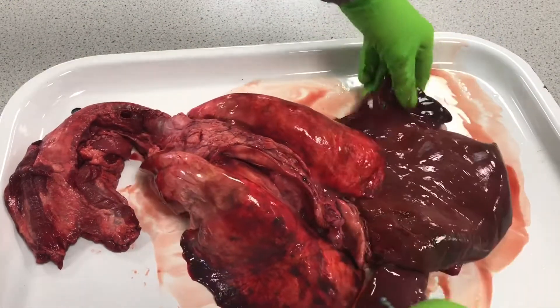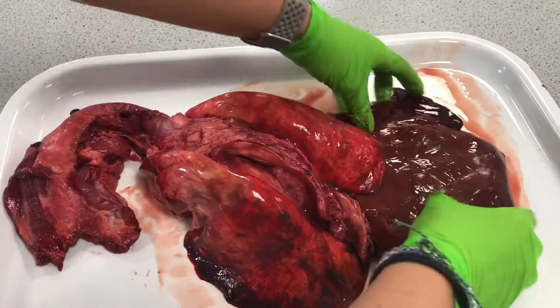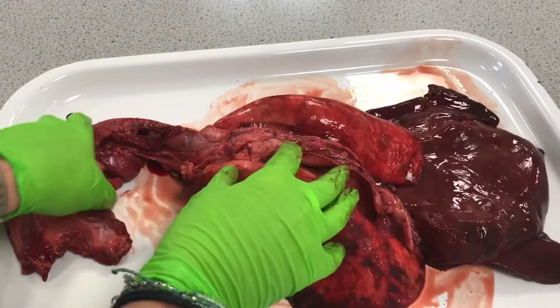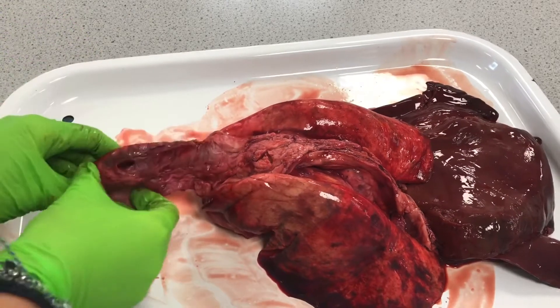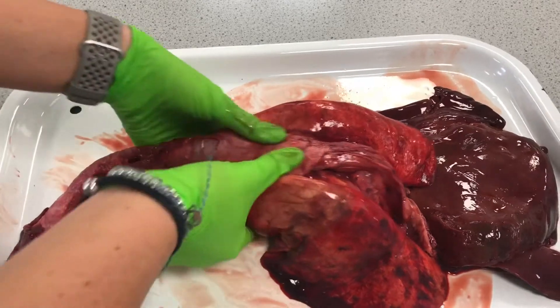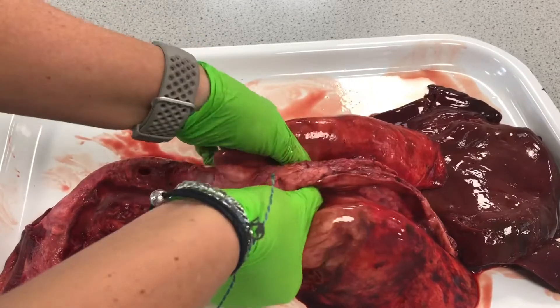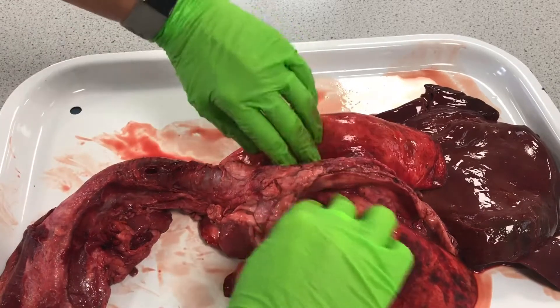Let's spread that out and sit it under there like that. Here we've got the trachea that leads down into the lungs, splitting off into the bronchi — one bronchus going into either side of the lungs.